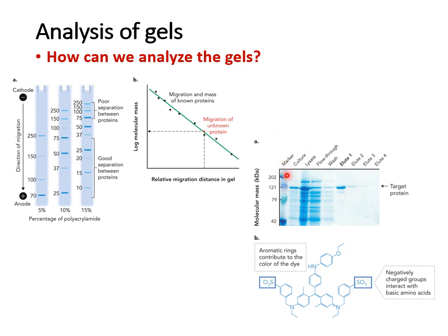Now, when you're analyzing gels, I want to point out a few different things. First of all, whether it is a DNA gel or a protein gel, anytime you run a gel, please make sure to always run what we call a marker. Sometimes we call it a ladder or a standard, okay? And that's critical. The marker or the ladder is basically a commercial tube that they sell that will have a given amount of known protein fragments.